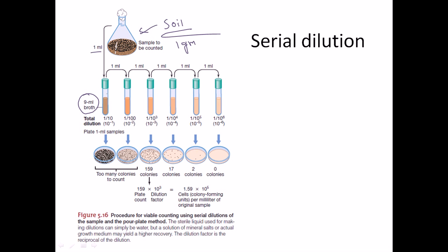We take one gram or one milliliter and put it into the nine milliliters, so the whole mixture becomes 10 milliliters. This solution is very dense, filled with soil bacteria. If we plate it using the pour plate method — the most convenient way to get colonies from a large mixed bacterial culture — it will give us a huge number of colonies to deal with.